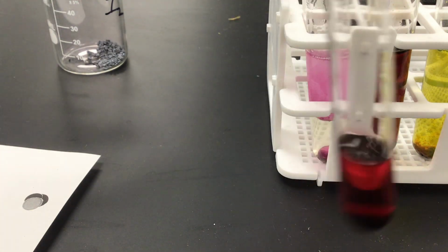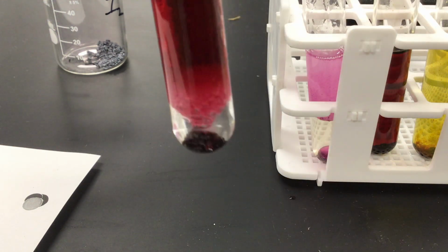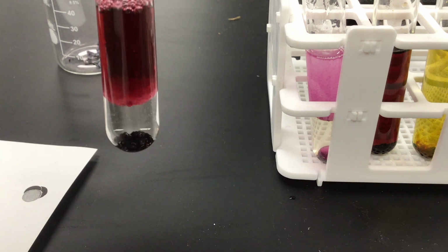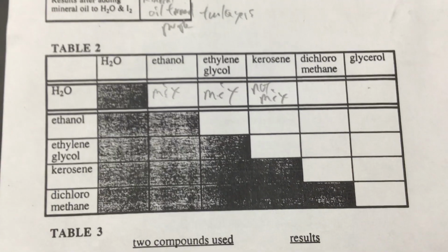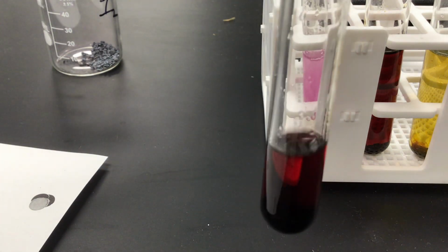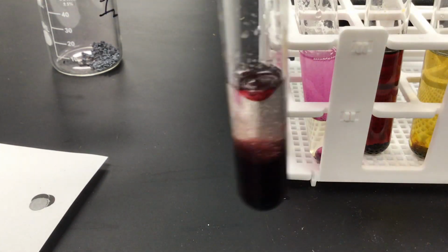Or kerosene and water. I'm going to kind of hold it just right here, but you can see 2 layers. You got the clear layer on the bottom and then the kerosene on the top, so they did not mix. Dichloromethane. Two layers.